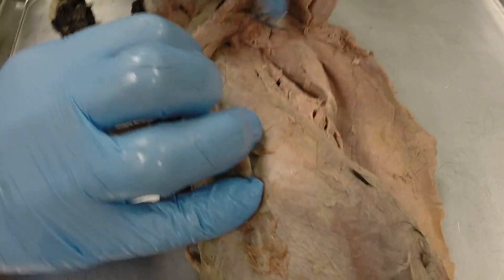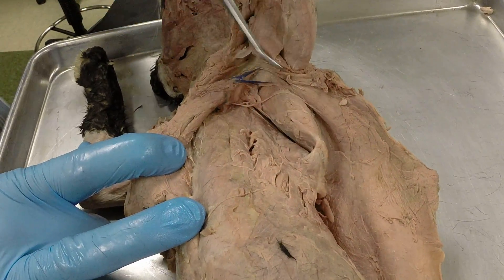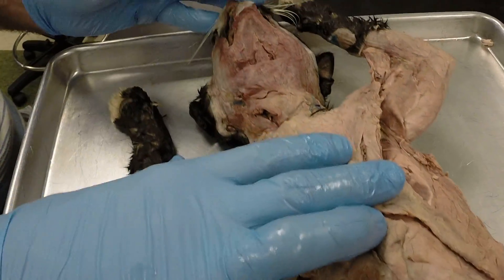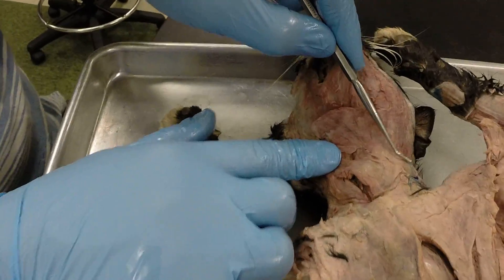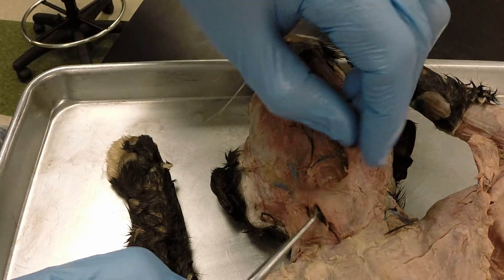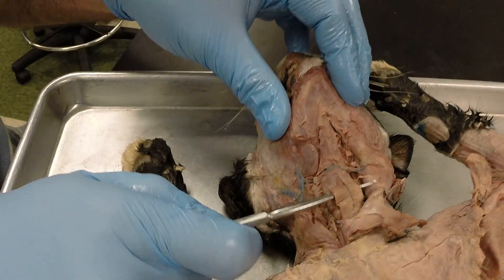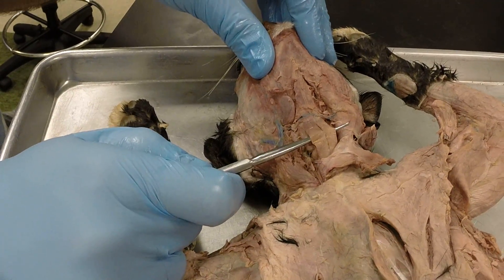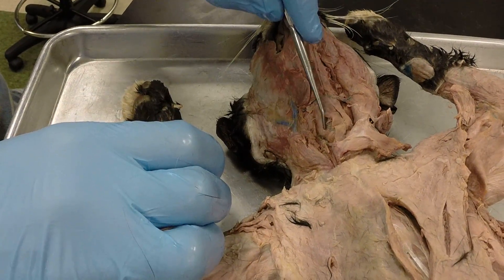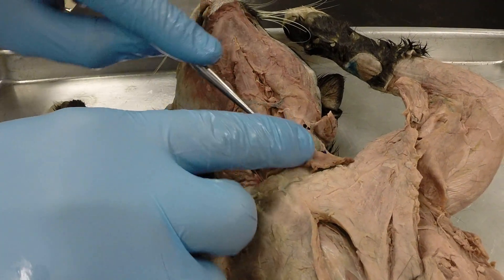Going underneath the pectoralis muscles, we have the serratus ventralis muscles and then the scalenes. Moving to the neck, the superficial muscle here is the sternomastoid. Peeling that back, we can see two muscles sitting over top of the trachea — these are the sternohyoid muscles. Think of them as being high on the trachea. Then we have the sternothyroid muscles on either side of the trachea.